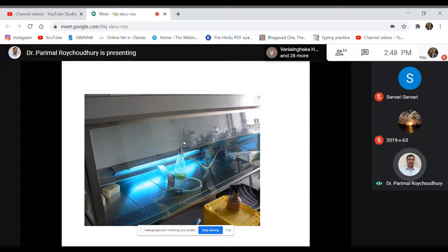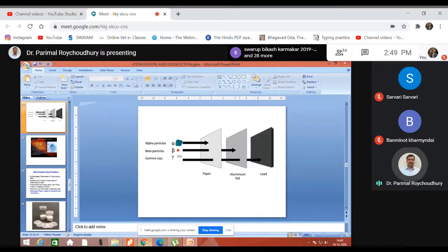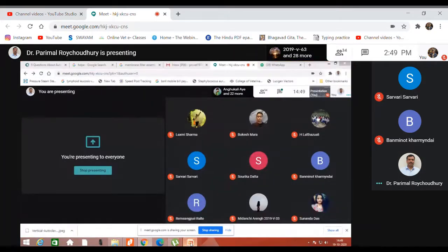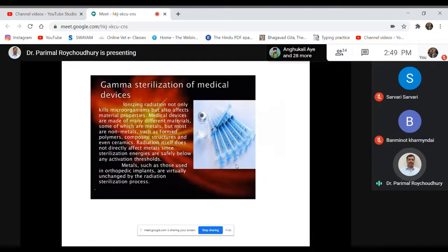These are some of the physical methods of sterilization. As the different ray systems, their penetrating power is shown here. The gamma rays are the most penetrable form of rays, and that can disinfect the items, that can sterilize the items, and the sterile items we can use. So these are some of the physical methods of sterilization.